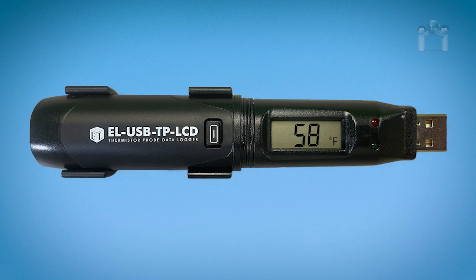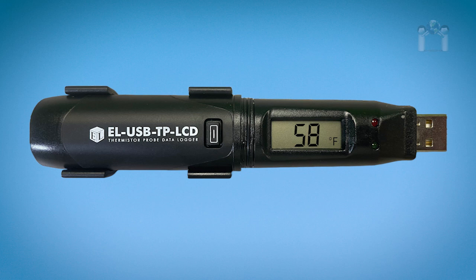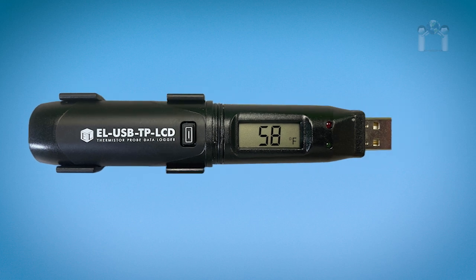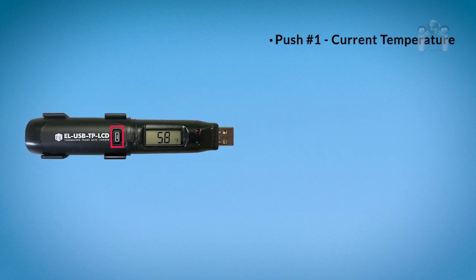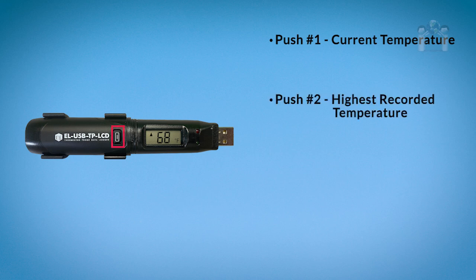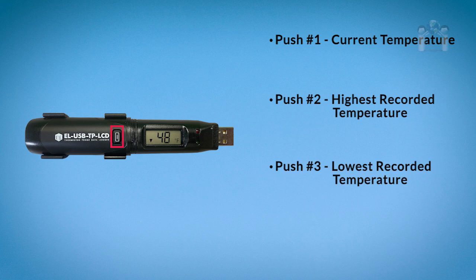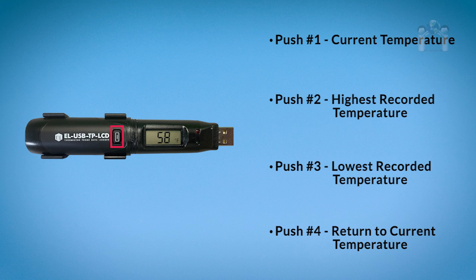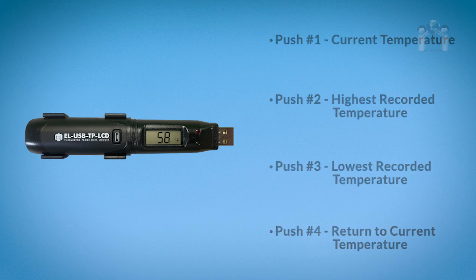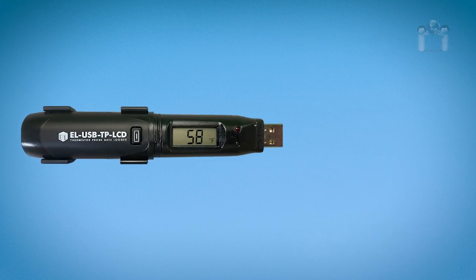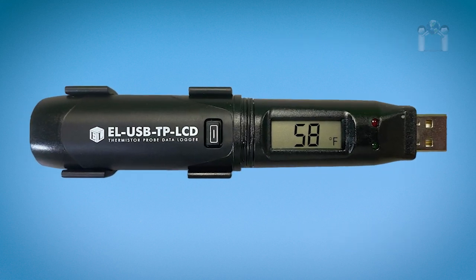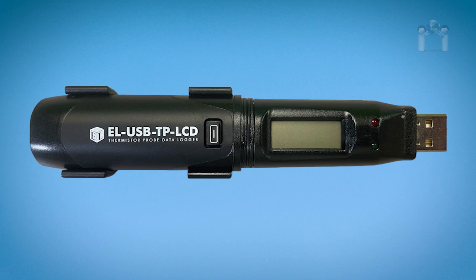If the LCD is not set to LCD off and the data logger is actively reading, you can press the button to review some of the readings from the current session. Press the button once to read the current temperature. Press the button a second time to read the highest recorded temperature. Press the button a third time to read the lowest recorded temperature. Press the button a fourth time to cycle back to the current temperature. Whenever you stop pushing the button, the display will clear after a few seconds.